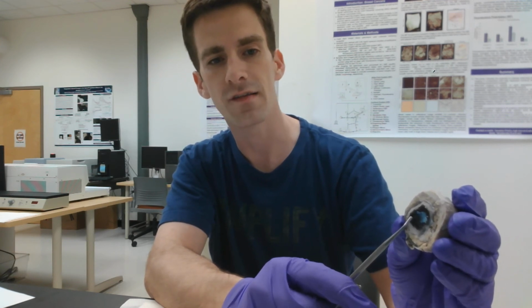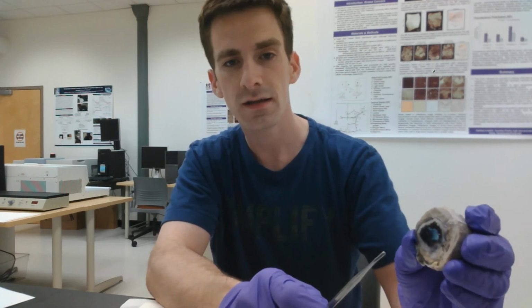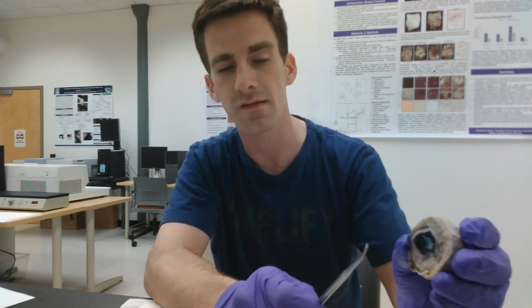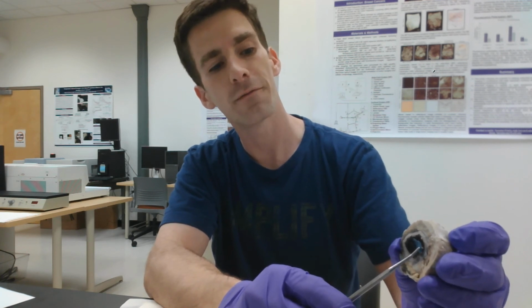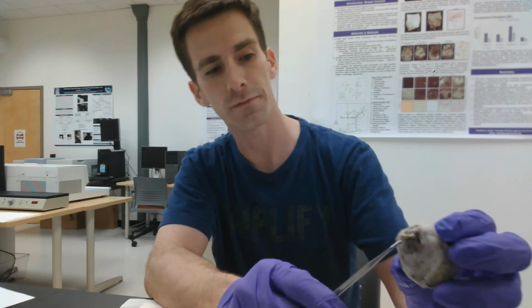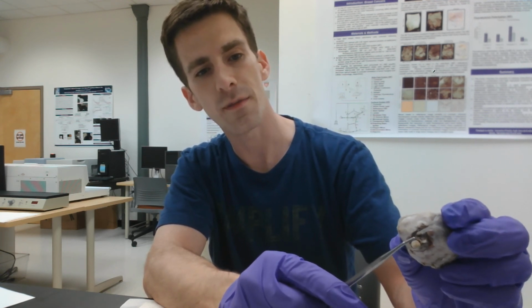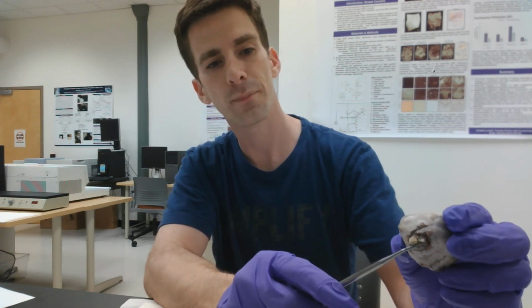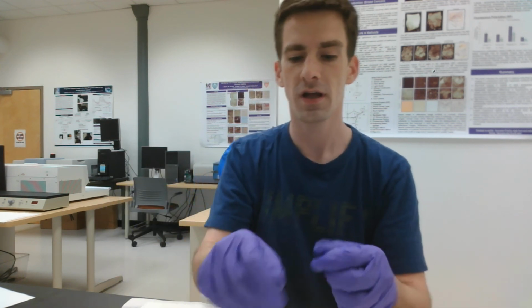And the retina is the part of the eye that converts the visual information, the light, into neural signals that travel into the brain for analysis and interpretation. And those neural signals travel from the eye to the brain via the optic nerve, which you can see here extending out the back, or posterior end, of the eye. So those are some of the very important anatomical and structural features of the eye.